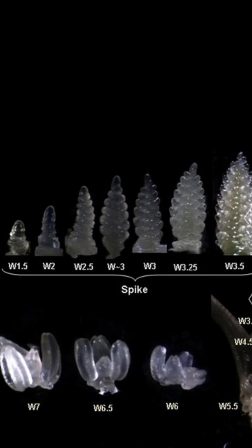Now, once we get to the meristem, which I've circled here, as you can see is tiny, we then need to score it. We use what is called the Waddington score to allow all scientists to know what we're talking about when we say it's at 2.5 or 3.25. And for my experiment, we want it to be at 3.25, which means it's a little bit more defined, but the terminal spikelet has not been developed yet.